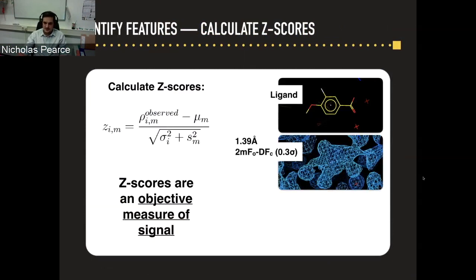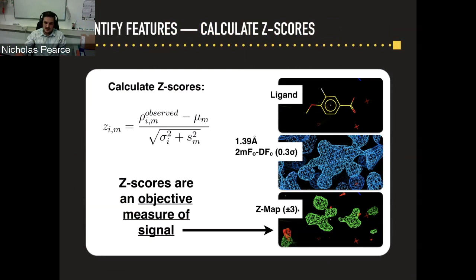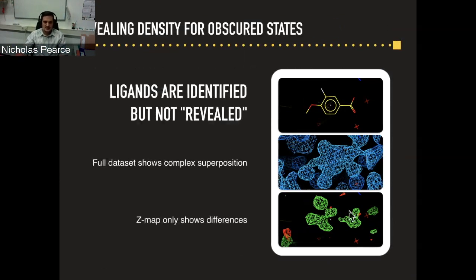To revisit the example I promised I would prove correct: this is the correct ligand pose I'm asserting. The 2FOFC experimental density is contoured at a very low level — you would never normally model into this. But if I calculate the Z-map, you can clearly see at the ±3σ contour a very nice peak for the fluorine, and other features that start to look more ligand-like. However, this doesn't solve all our problems — we can now identify where interesting things have happened, but we still haven't revealed electron density for our ligands. The Z-map only shows differences; it doesn't reveal the density for the ligand itself.